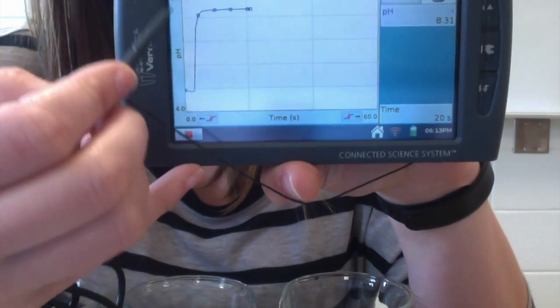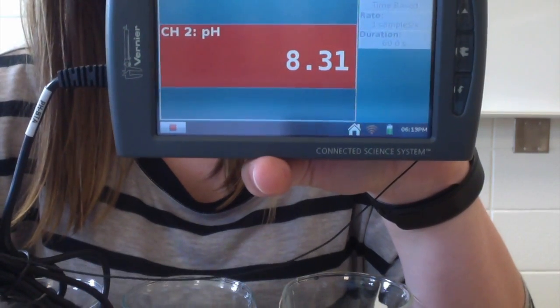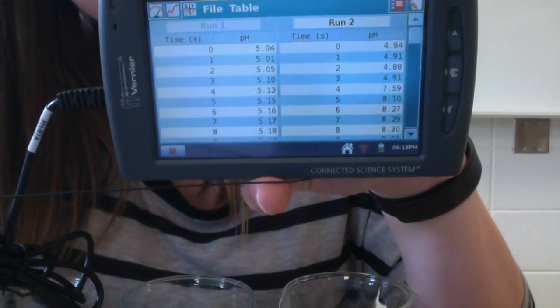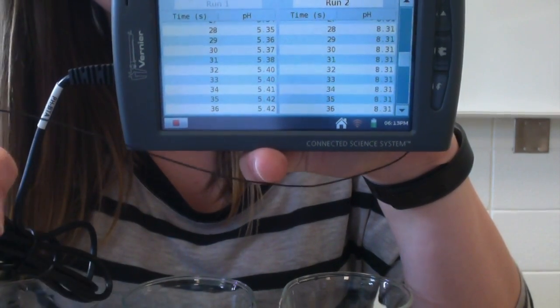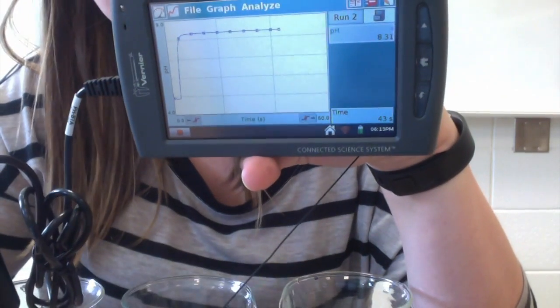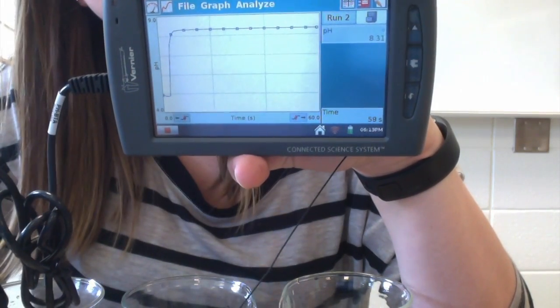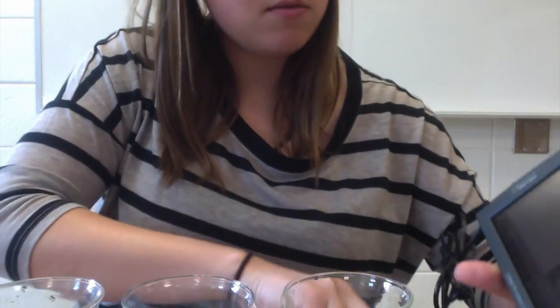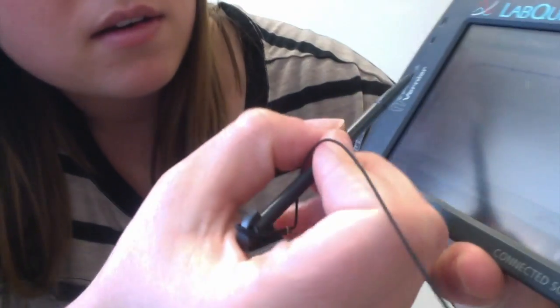And you can watch it come in live there. Or in table form. And it's being compared to the first run, you can see. It's pretty neat. Great. So now that the data is done collecting, you see here that big jump.